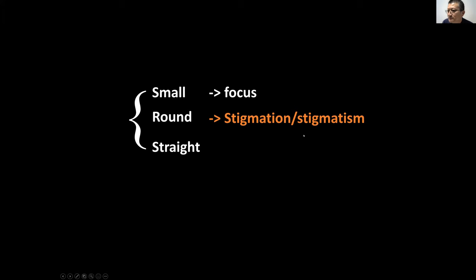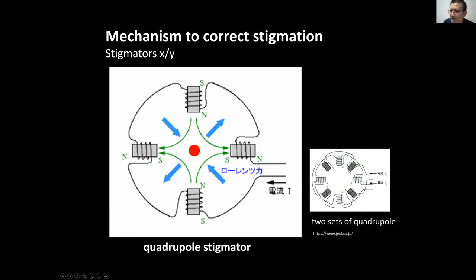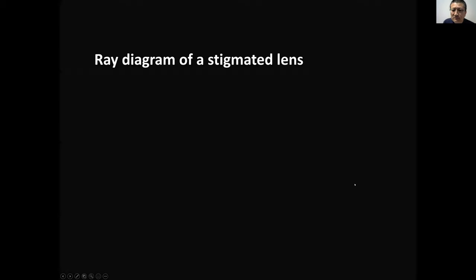This phenomenon is called astigmatism or stigmation. If the fields are not symmetrical — not perfect — we need to correct it. Inside the SEM column we have two sets of small stigmator magnets around the lens. When you have an imperfect oval beam, you apply X and Y corrections to squeeze the beam back into a perfect circular shape. Some SEMs have four sets of stigmators for finer control.